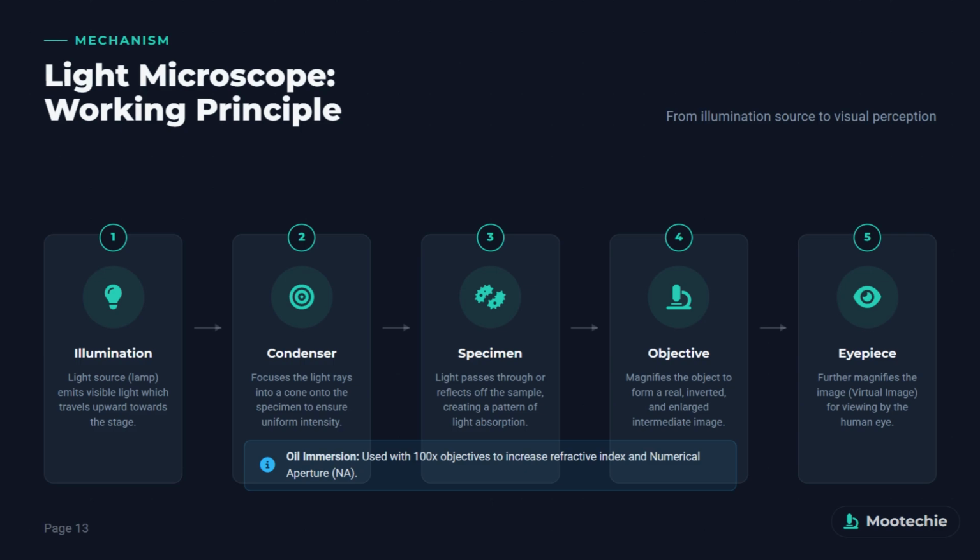A special technique, oil immersion, is used with the strongest objective to reduce light loss and get the clearest possible picture by matching the refractive index.